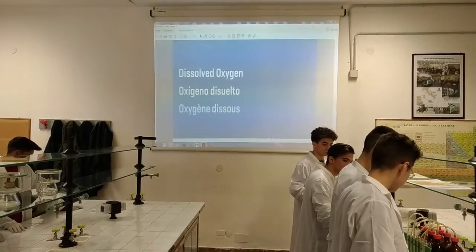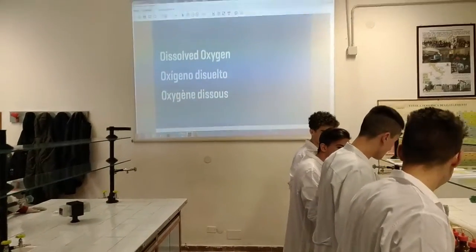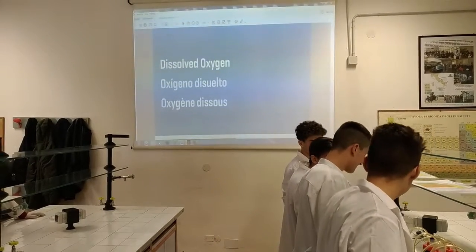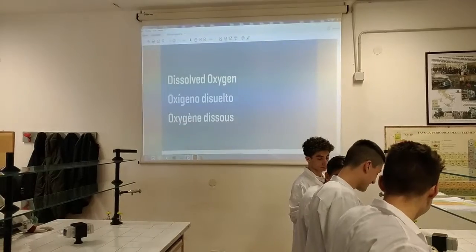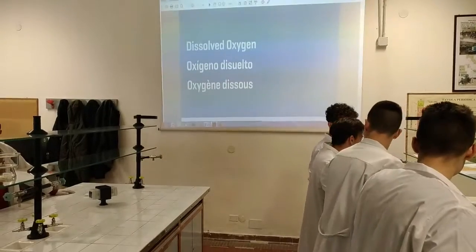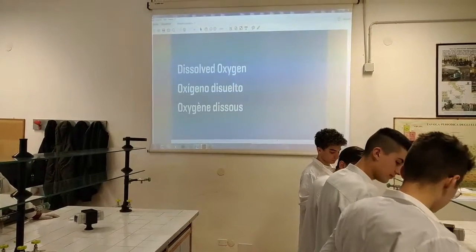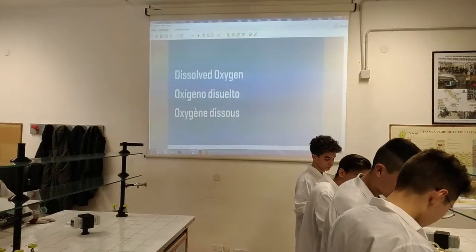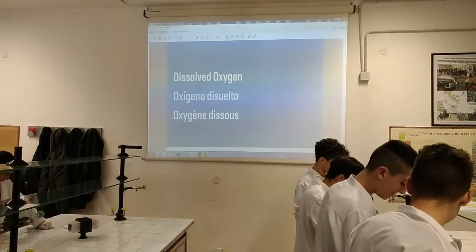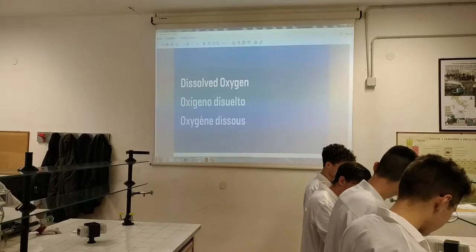Today, we will perform a chemical analysis to determine the dissolved oxygen in the waters of the water bodies. In particular, we will examine the samples taken in our river Lower Imera, also called River Salso, making a titration test. Remember that at the end of the test, we have to use the atmospheric pressure reading from a barometer or a local altitude to determine the correction factor from the chart below and multiply the dissolved oxygen test result ppm by the correction factor to obtain the corrected dissolved oxygen value.